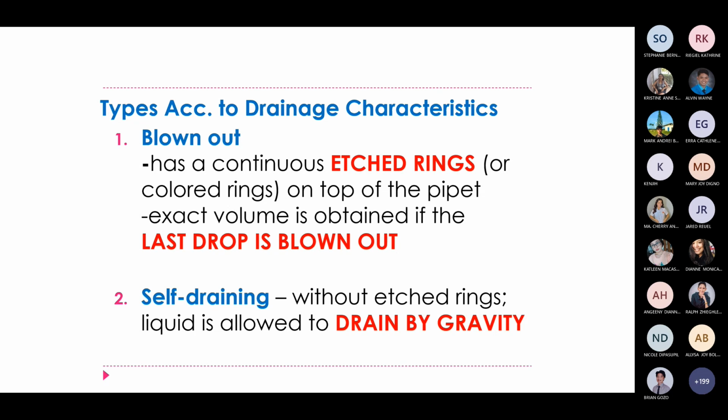Kahit ang corny-corny ni ma'am. Okay na. The second one is self-draining. Kaya nga self-draining, it drains by gravity. Hindi mo na kailangang pilitin, kusang nagde-drain. And syempre, wala siyang etch, kasi nga, hindi mo siya binlow.